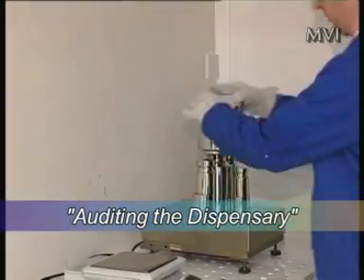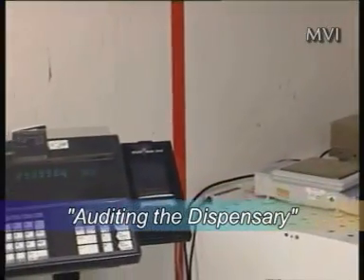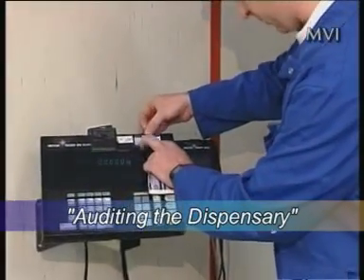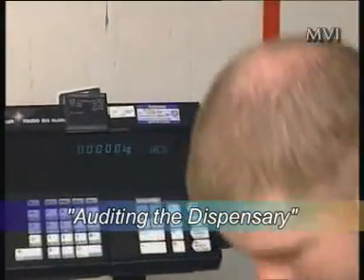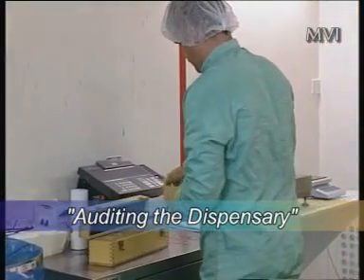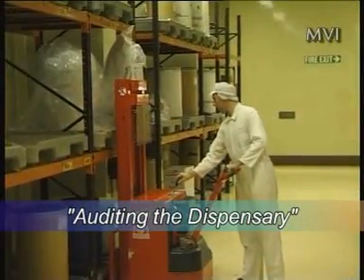They should all be included in a calibration and maintenance program, because electronic balances can really only be adjusted in response to calibration drift by highly trained balance specialists. But there ought to be frequent tests by the dispensary personnel using check weights. How does the company organize dispensing?